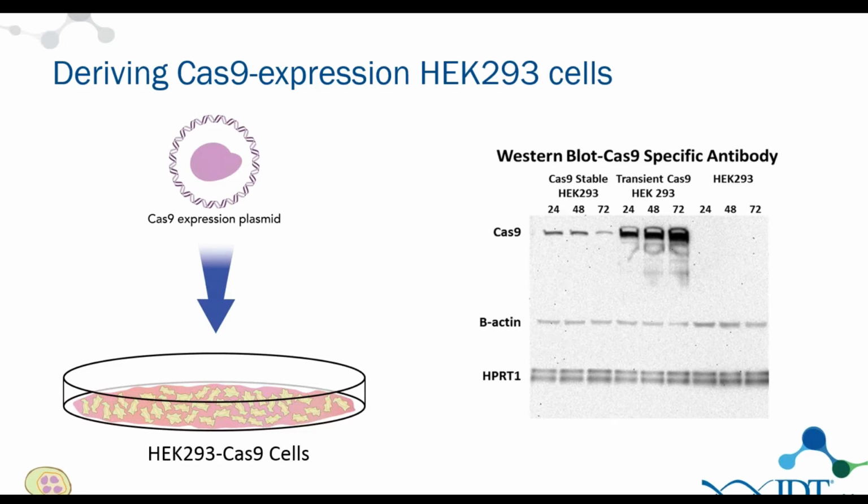The main reason why people are worried about overexpression of Cas9 is that you have a lot of protein in the cell, and typically there's only a low amount of targets available in the cell. So you are stuck in a situation where you have a lot of protein that, to say it in a very simple way, has nothing to do, and so will most probably pick other DNA and RNA sequences, causing these unwanted off-target effects.